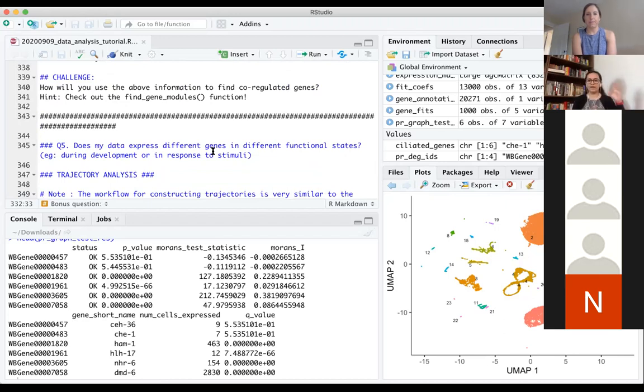It helps you find genes that are regulated in tandem, and then you can also do pathway analysis on those sets of genes to see what sort of pathways are up or down regulated, like GSEA, DAVID, GO, basically. That takes you towards gene set enrichment analysis testing.